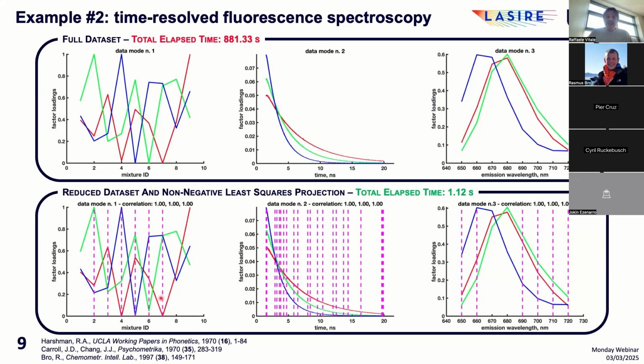If one has also a closer look, for example, at the essential rows selected, please see the dashed line in this figure, it is evident how 4 out of 6 relate to chemical mixtures constituted by only 2 of the 3 fluorophores considered, and for which the ParaFac-ALS loading profile of the missing component assumes values approximately equal to 0.